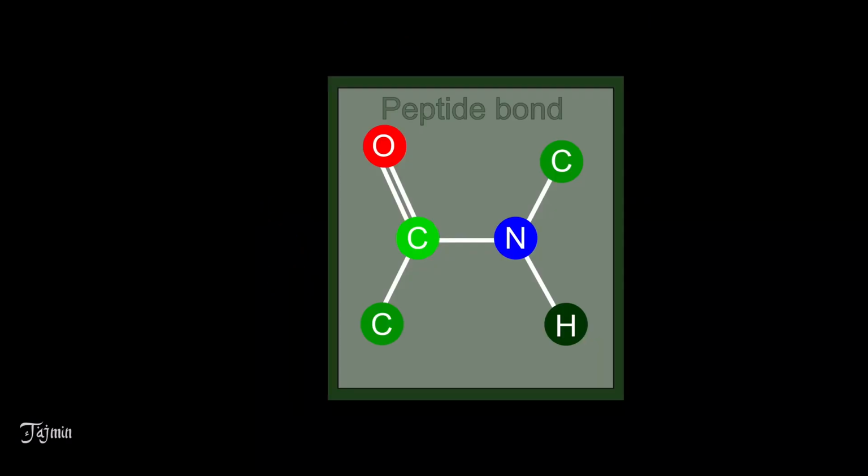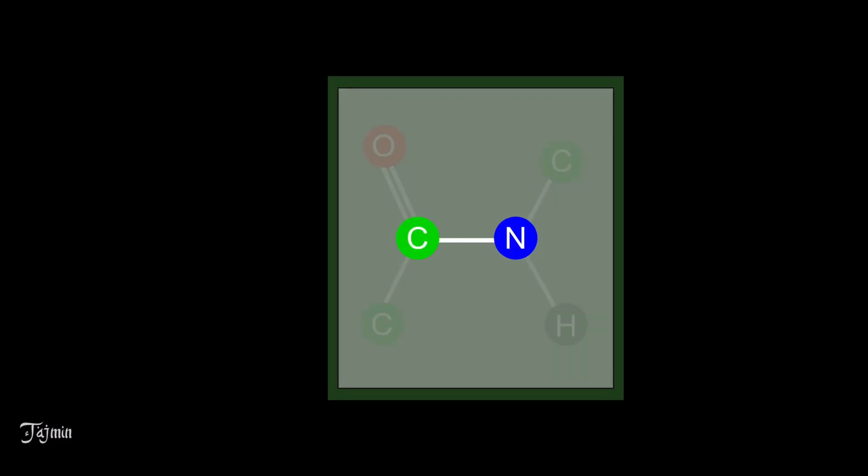To calculate a dihedral angle in proteins, we need 4 atoms or 3 consecutive bonds. Keep the bond in the middle whose rotation angle you are going to measure, and take one more atom on each side. Let's assume these 4 atoms as ABCD, where the bond BC rotation angle is being calculated.